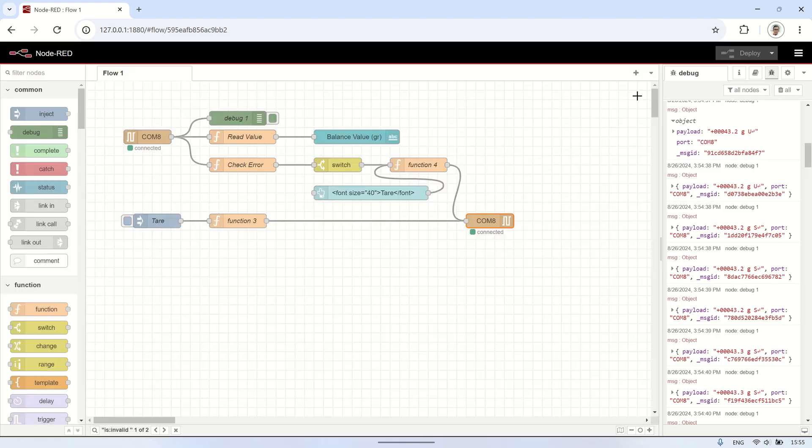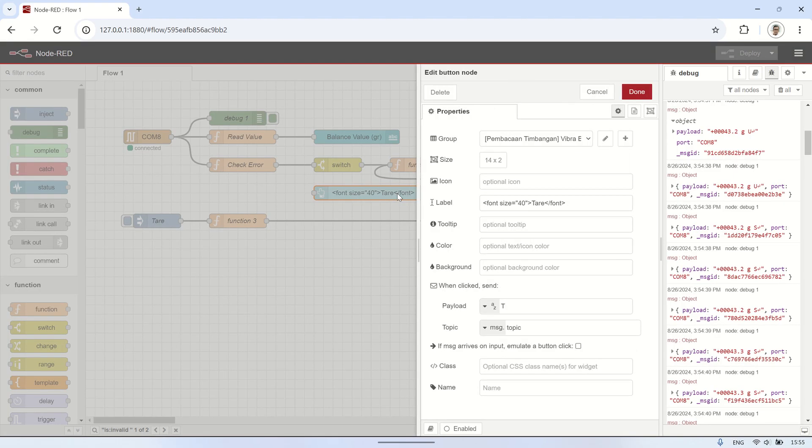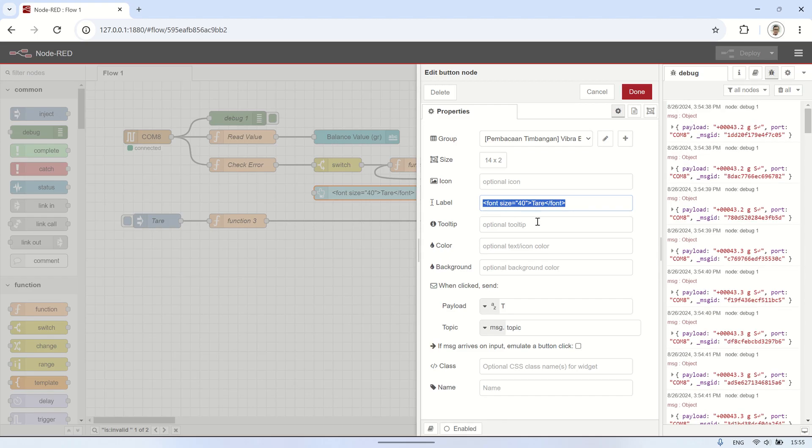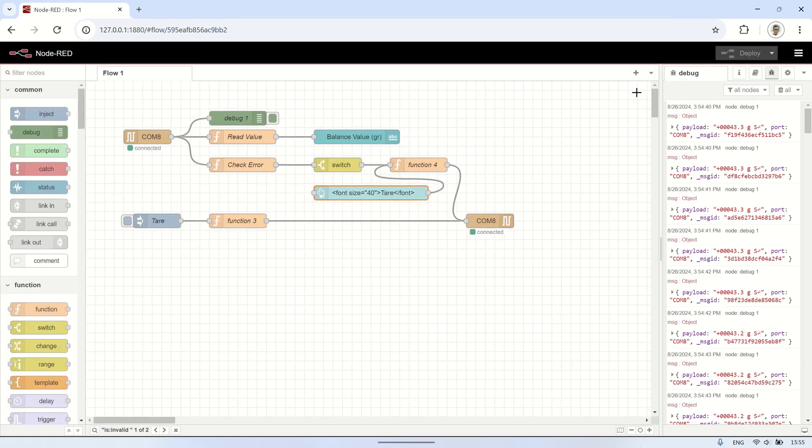In addition to using the balance's error output as a trigger for tare, I've also added a button for manual tare. When the tare button is pressed, it sends a tare command to the serial out.